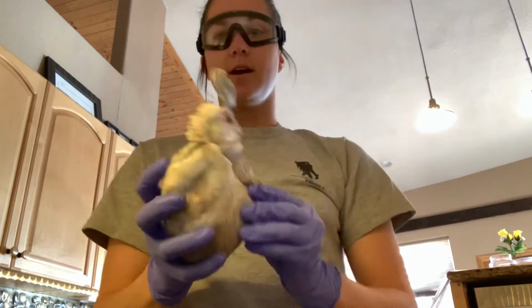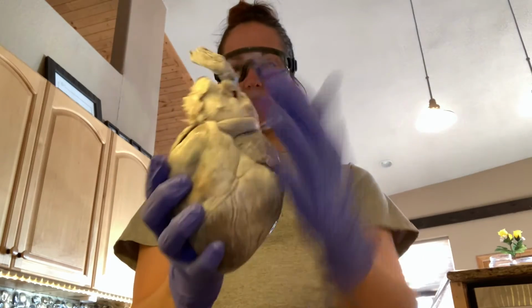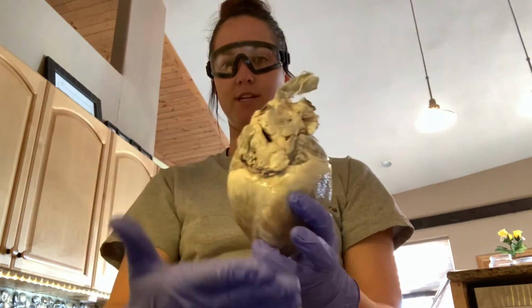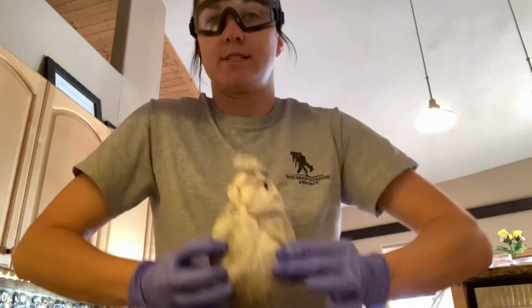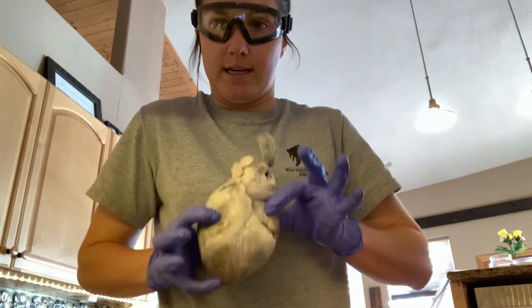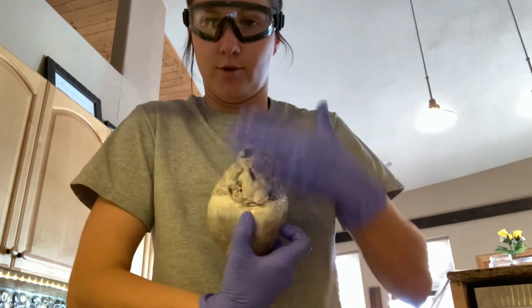So, as we're looking at the heart this way, this is the anterior aspect of the heart. If we flip it around this way, this is the posterior aspect of the heart. So as it resides in our bodies, it will look most like this. Anterior, posterior.